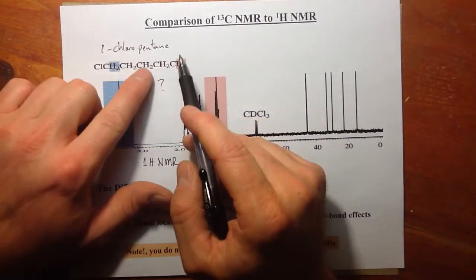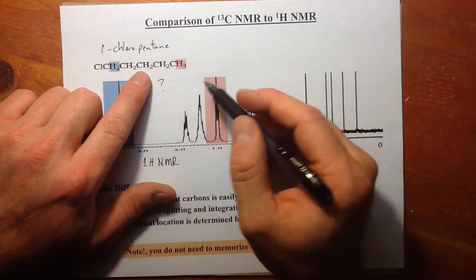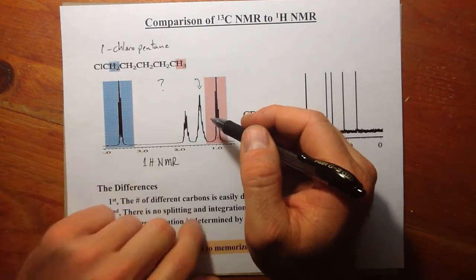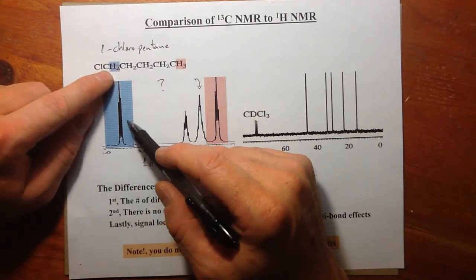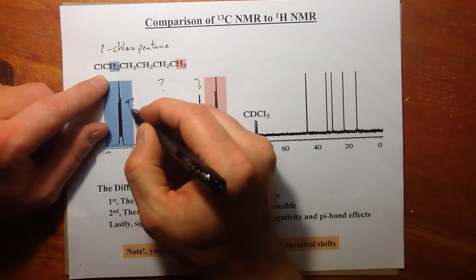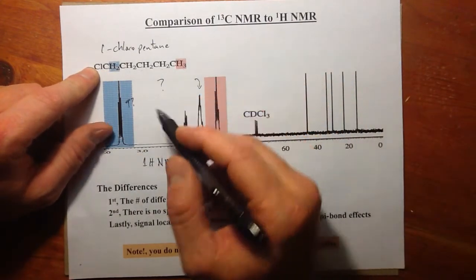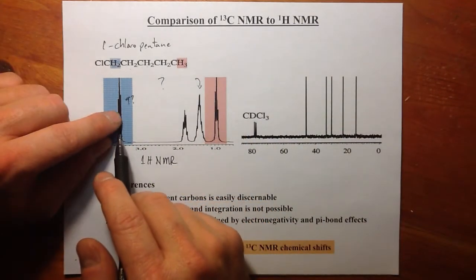Well, it's just the problem of having protons that are just too similar. They're not exactly similar, but these 2 sets here, these 2 and these 2, just have signals that are very, very close and just cannot be resolved. Probably underneath this signal here, we have 2 signals just overlapping. So we can argue that the one that's most downfield would be for these 2 protons, and it seems to show a triplet. It would be explained by being next to a proton on a sp3 carbon that's bonded to a heteroatom, as we said in the last slide. So we'd say that's in the 2.5 to 4.5 range, and certainly falls there.